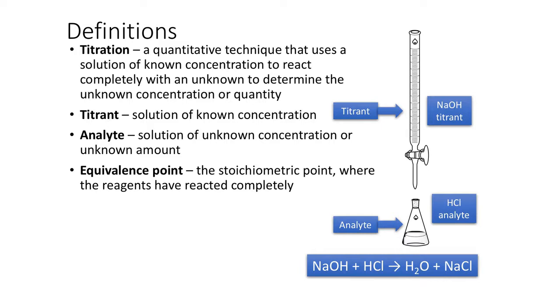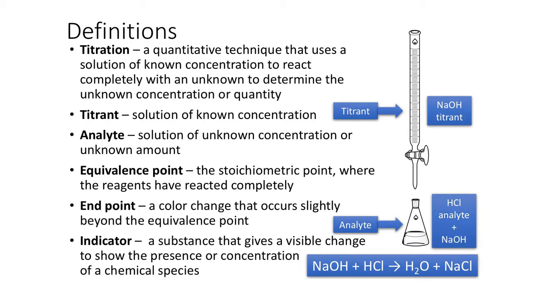In today's experiment, sodium hydroxide will be the titrant, and hydrochloric acid will be the analyte. The sodium hydroxide will be added to the hydrochloric acid until the equivalence point is reached, which means that all the base and acid have reacted to form water and salt.